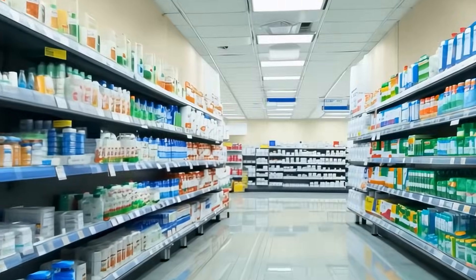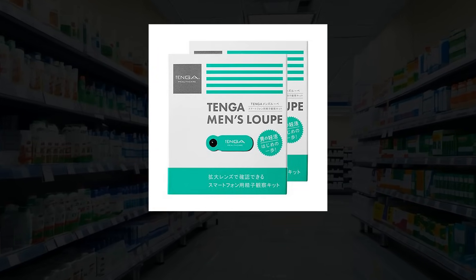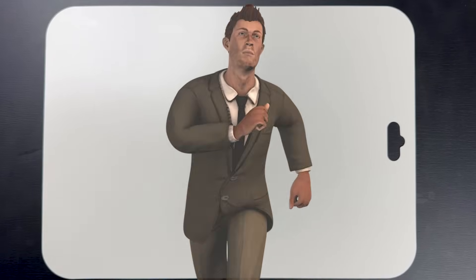I found a sperm observation kit at a local drugstore. I decided it was finally time to make a video about sperm, so I bought it and headed to the lab.